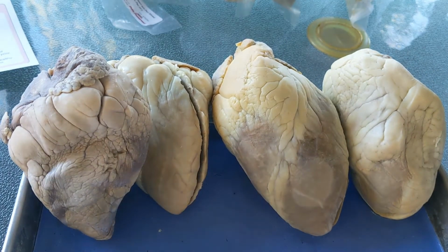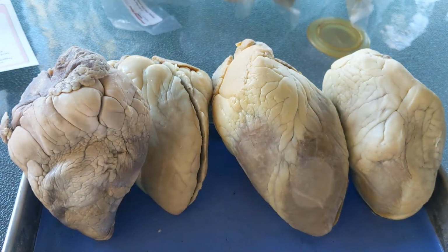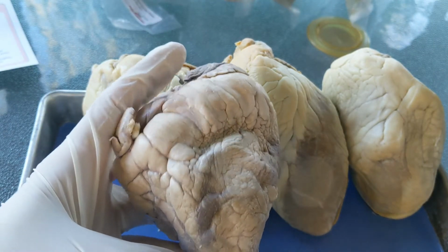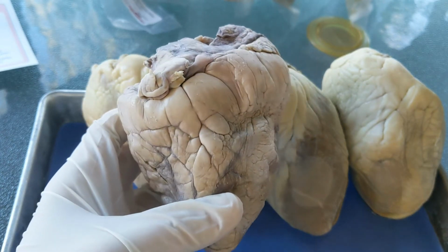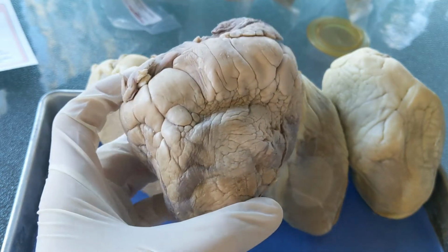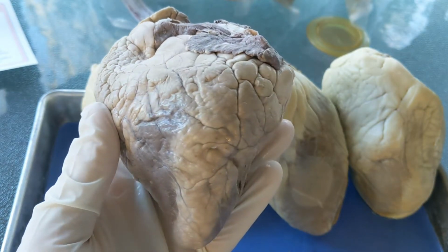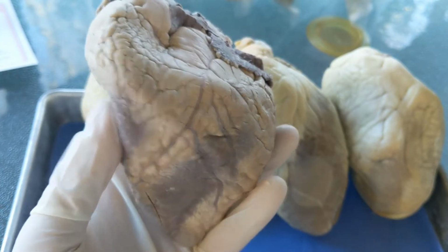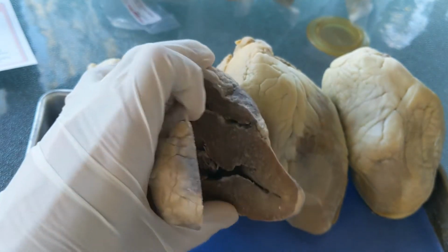So we have 4 hearts here, and I've lined them up from case A, B, C, and D. These are the hearts. So here is our 65-year-old overweight female. And first we're going to look at the front of the heart. See if you notice anything irregular about coronary arteries. And the back of the heart. Again, the main thing we're looking at is the coronary arteries. Do you notice any blockages in any of the arteries? And then we're going to open up the heart.